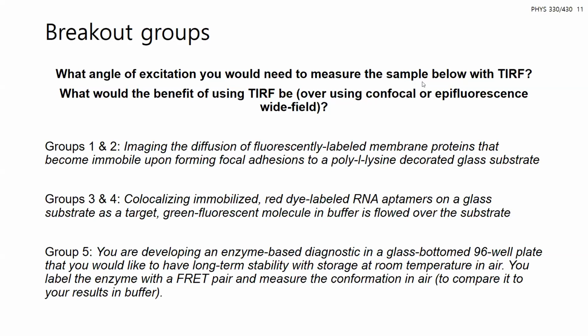And this was probably the most challenging one, because if you're measuring in air, there's not going to be anything diffusing over the top that should be fluorescent. So there's not as much of a benefit if you're doing air. It even took me some time to come up with a situation where you'd be measuring in air, because in biophysics, there's always some water present. But you can still get to the same length scale in X and Y, but not typically in Z. But yeah, you guys did pretty good with that, mostly identifying what the refractive indices are for what your sample is. Okay.